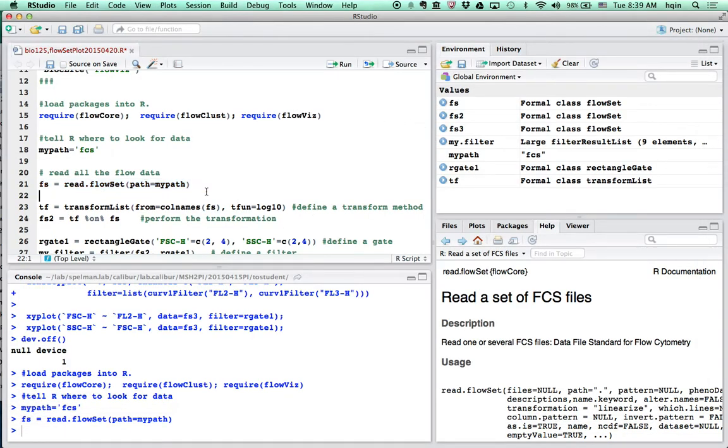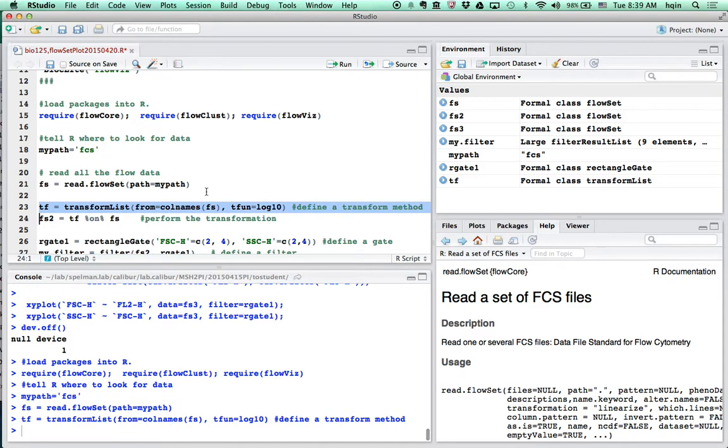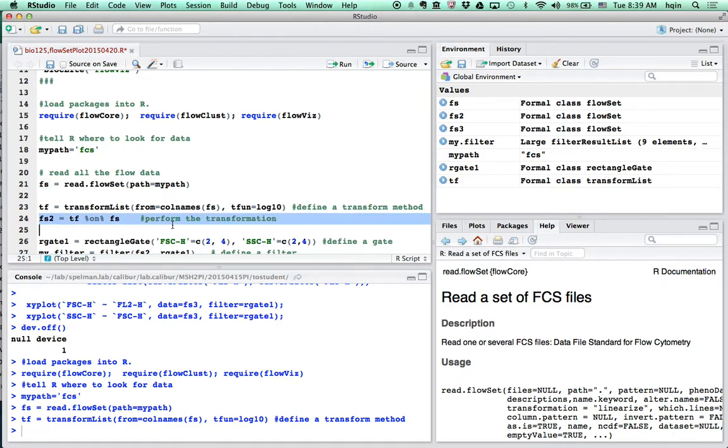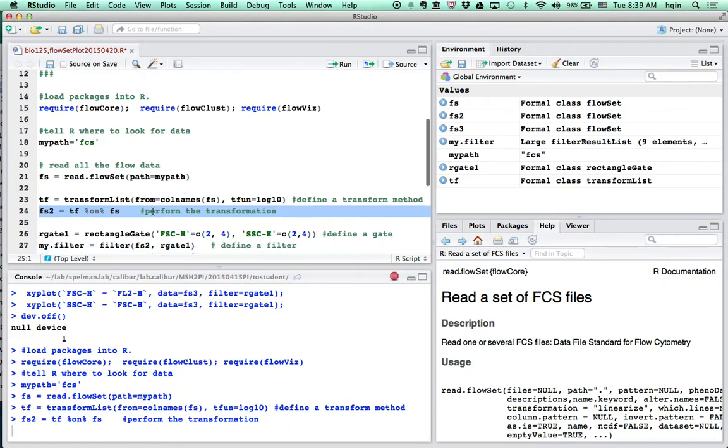Once we read into R, we need to transform the flow cytometry signal. In this case, I'm doing a log10 transformation. And then I apply the log10 transformation to the fs, which is the flow cytometry data. That's basically just to perform a transformation.